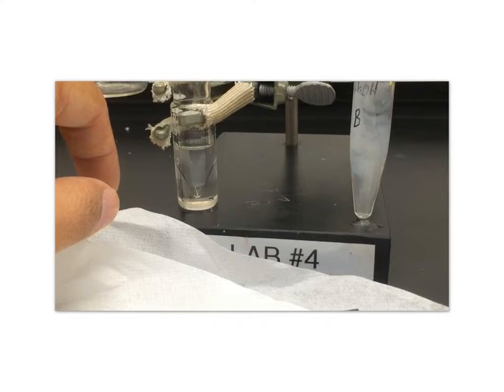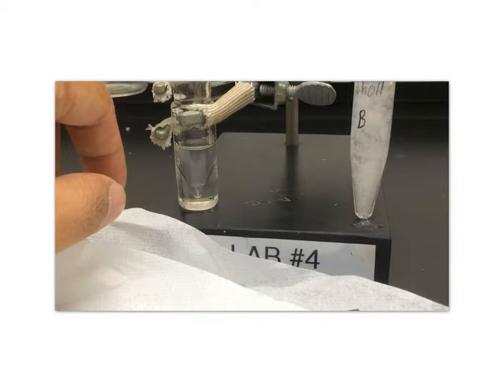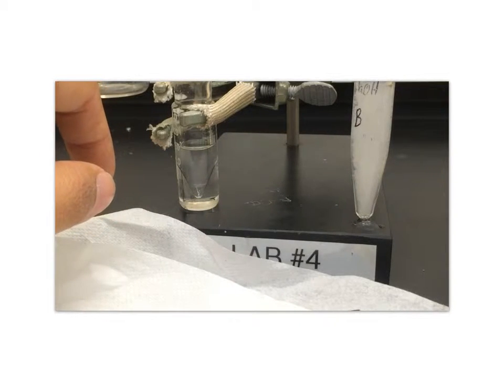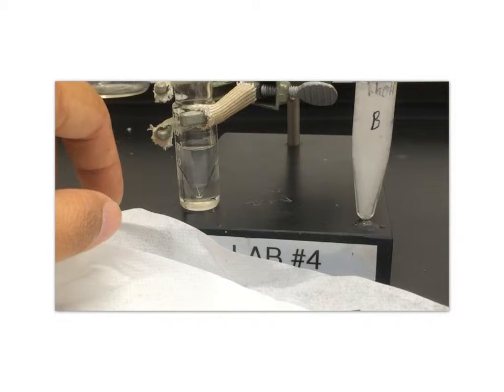In order to extract the acid, we went back to our first centrifuge tube and added aqueous NaOH. The NaOH would react with the organic acid's carboxyl group and make it soluble in water by removing a hydrogen ion and giving its oxygen a negative charge, thus making it soluble in water. This aqueous layer was also then removed and put in a separate centrifuge tube to be back extracted.